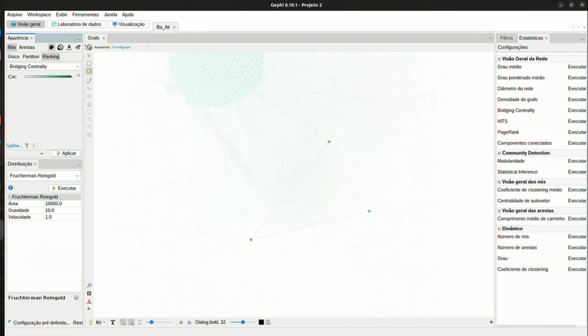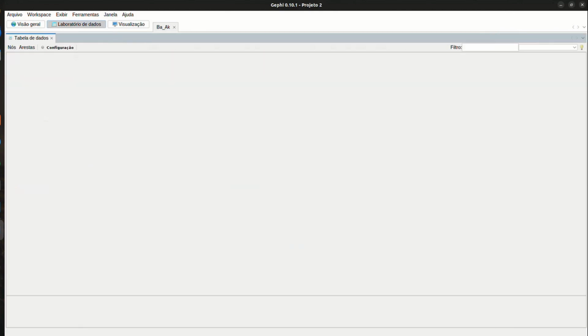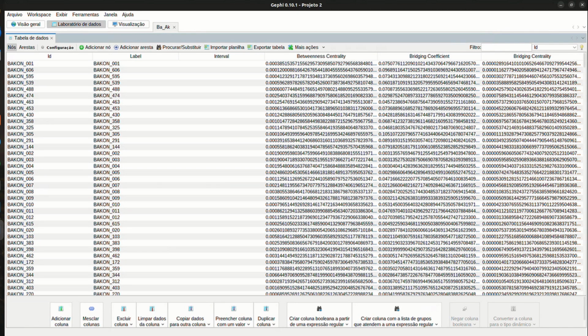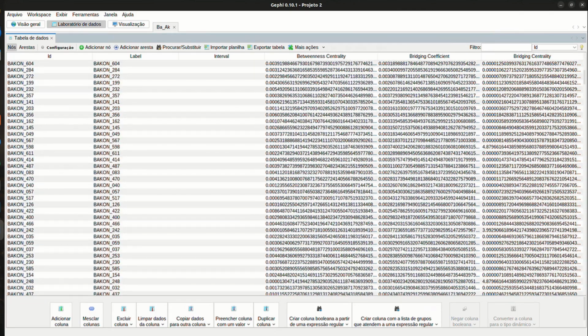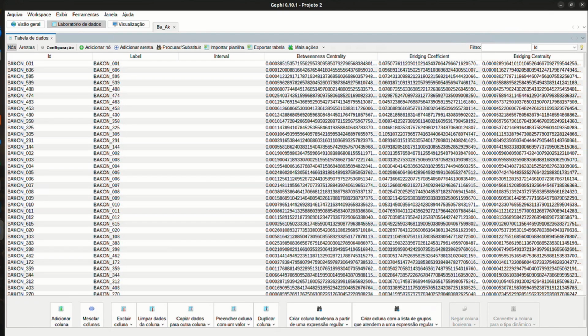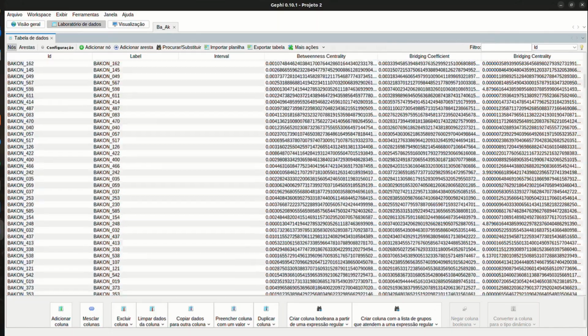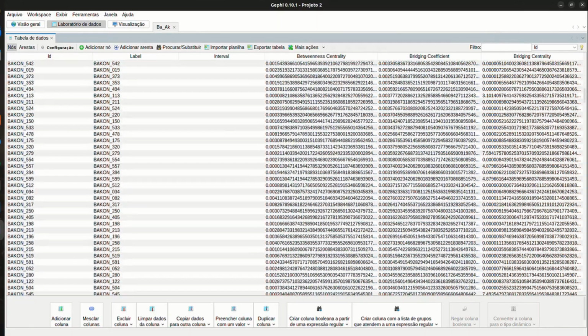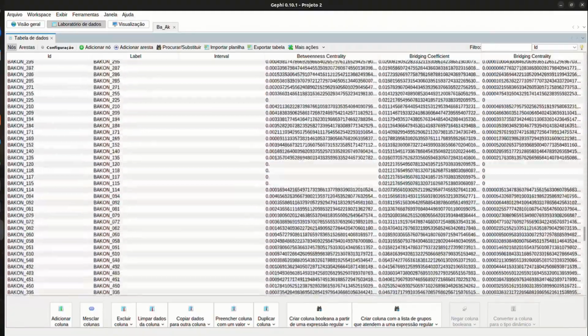So, now we have the top node according to bridging centrality in dark green color. We can see that now in GenPPI the number of nodes is very large, also due to the number of interactions, helping more in the discovery of important proteins. And with the help of GenPPI with my plugin, Bridge Centrality, we have a very good chance of discovering much more than I am showing and with little known genomes.